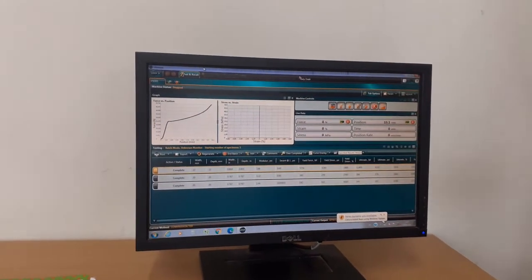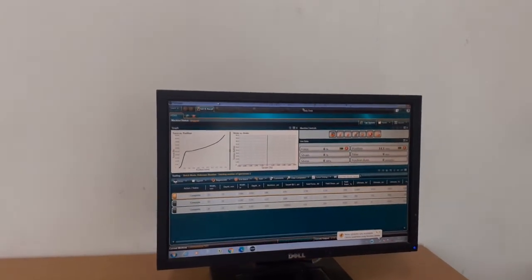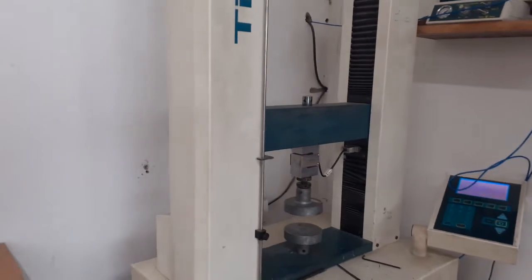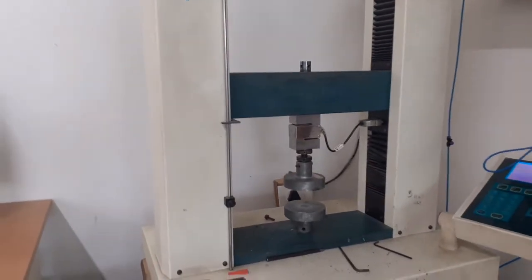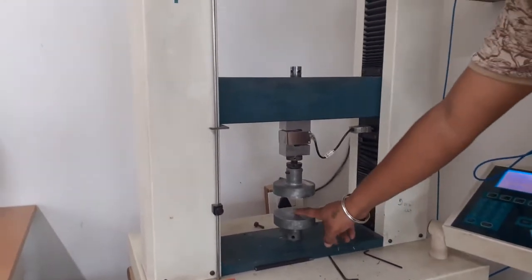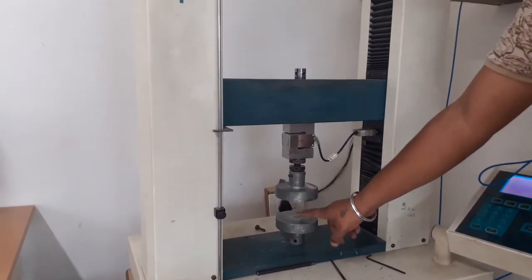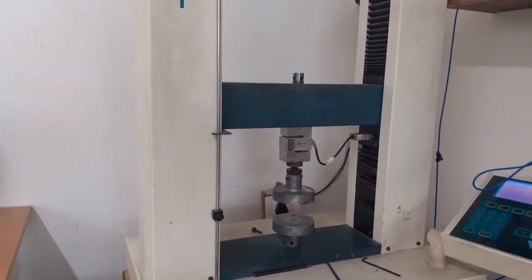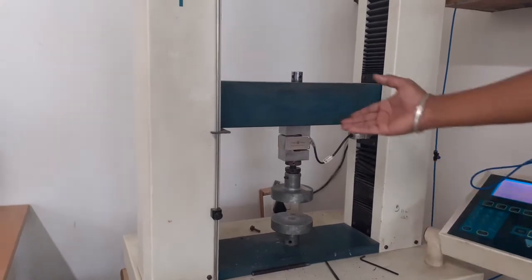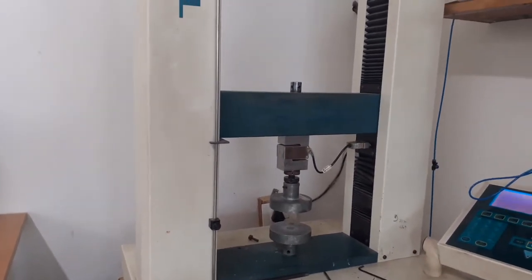For the compression test, the clamps are like this because we need to sandwich our sample in between these flat clamps. We use a 50 kilonewton load cell, so first we have to cut the sample.